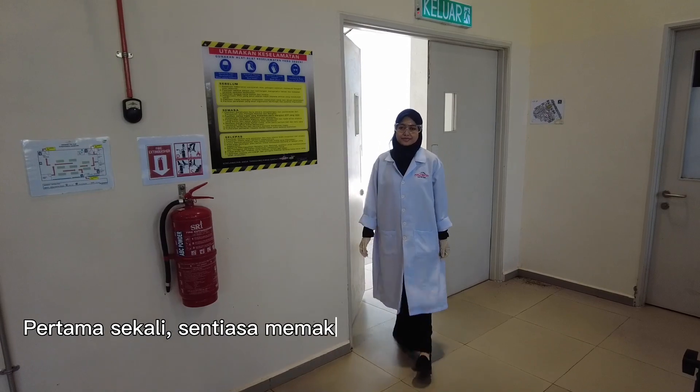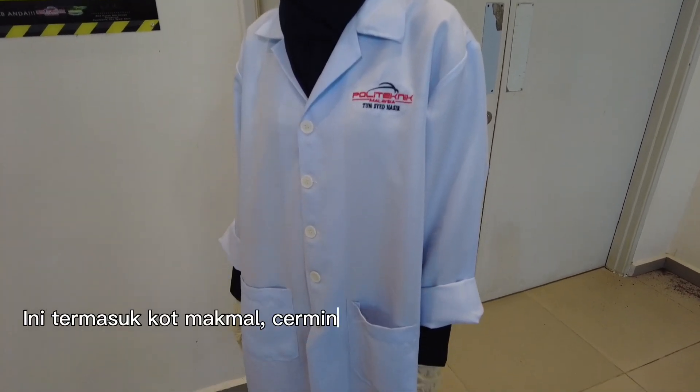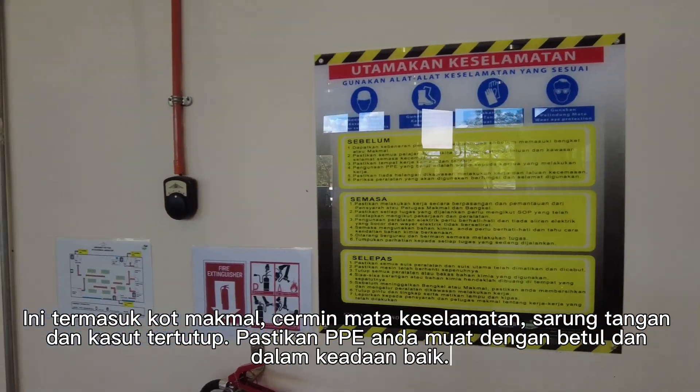First and foremost, always wear the appropriate personal protective equipment. This includes lab coats, safety goggles, gloves, and closed-toe shoes. Make sure your PPE fits properly and is in good condition.